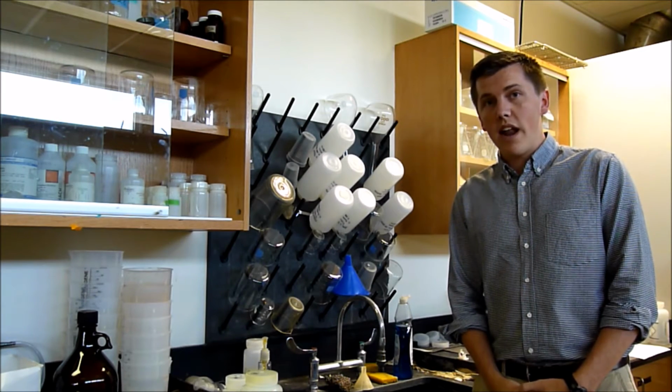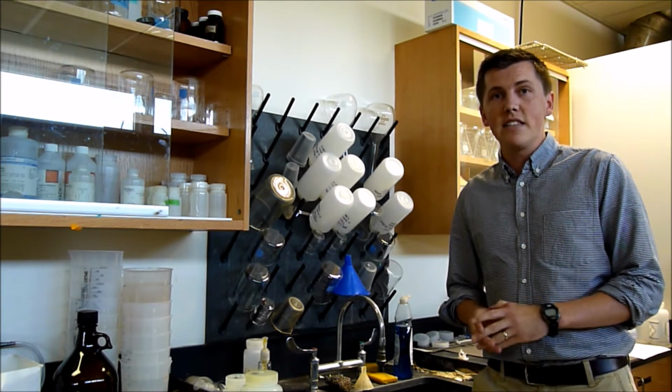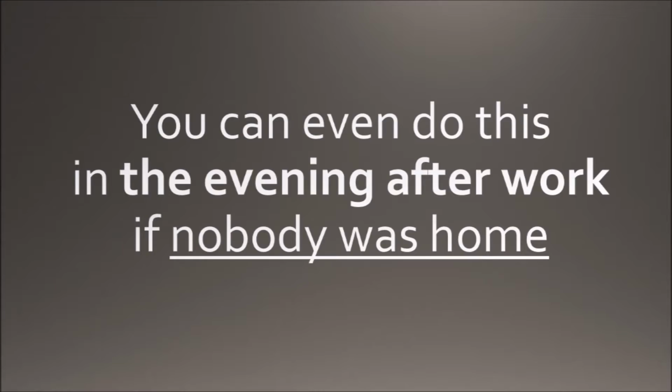And the most important aspect is that the water has not been used in your entire house for at least the last 6 hours. The easiest way to do this is to sample first thing in the morning, right after you've woken up.